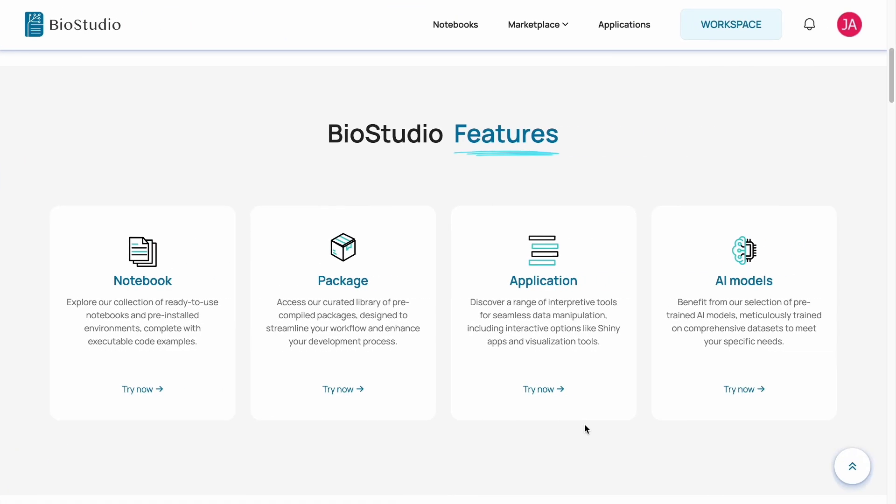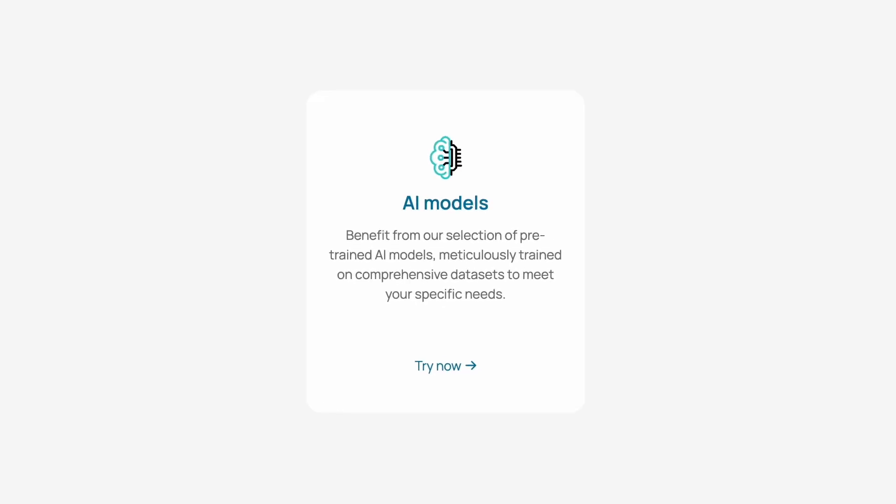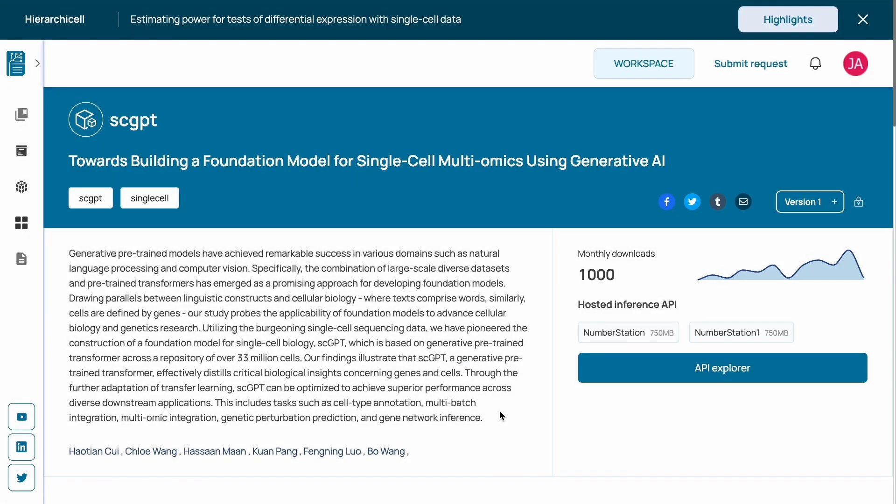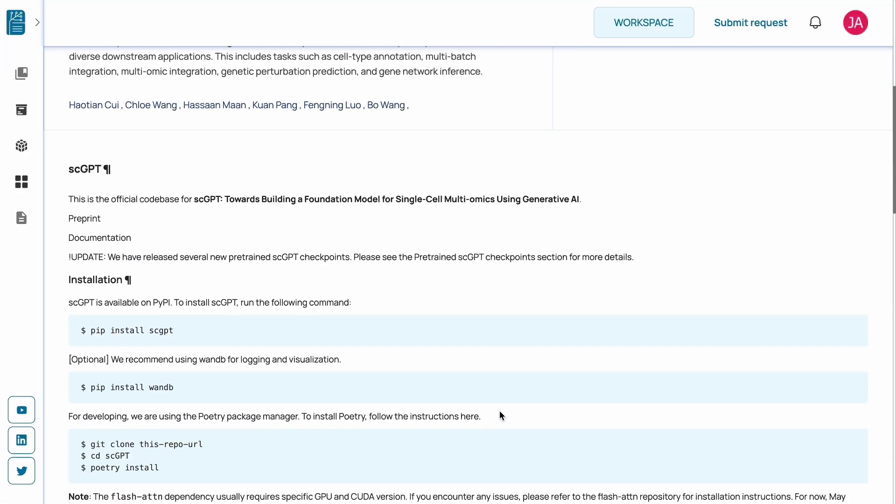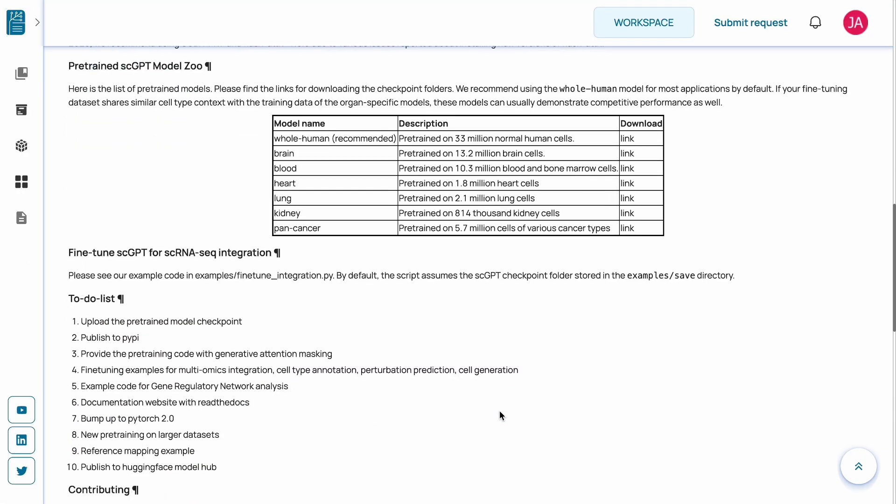Finally, BioStudio provides pre-trained AI models meticulously trained on comprehensive datasets, such as SCGPT, a foundation model for single-cell multiomics using generative AI.